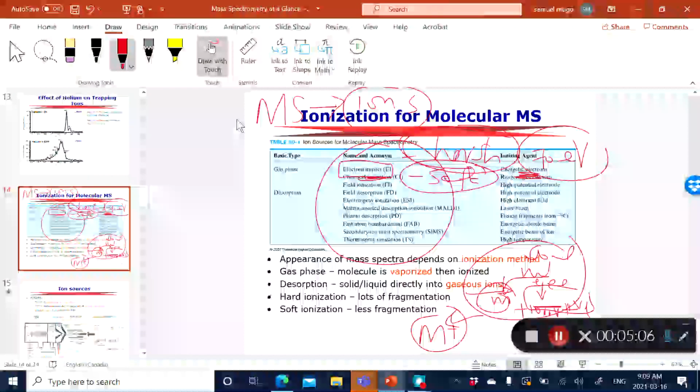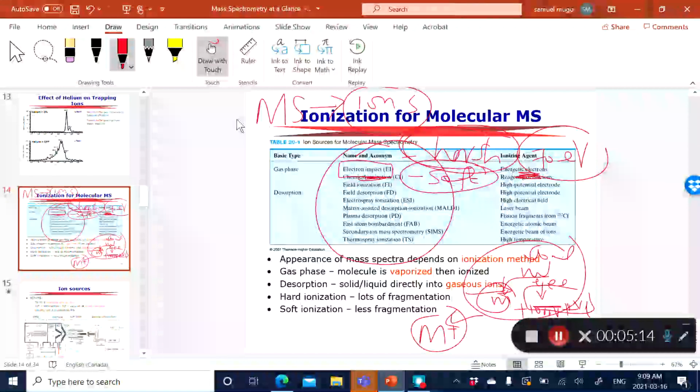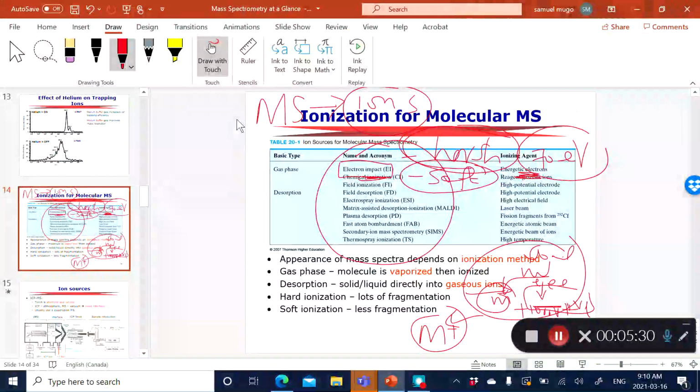So you can see it's almost a chemical derivatization method, where you derivatize the reagent gas using electron impact, and then the charge in the reagent gas is transferred to the analyte using different types of mechanisms that I'm gonna talk about, either protonation, deprotonation, and so on, even cationization sometimes. So this chemical ionization really is a little bit softer compared to the electron impact.